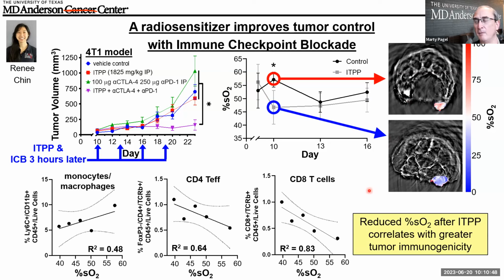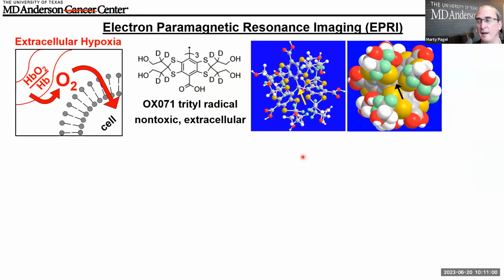So we really, again, want to study the PO2, partial pressure of oxygen, within the tumor extravascular environment. Now, are we going to get there? Well, I think EPR has some merits there. So we want to study this O2 between the blood vessel wall and the tumor cell surface, right? That extracellular, extravascular environment where the immune cells are collecting and doing their job, or hopefully, right?